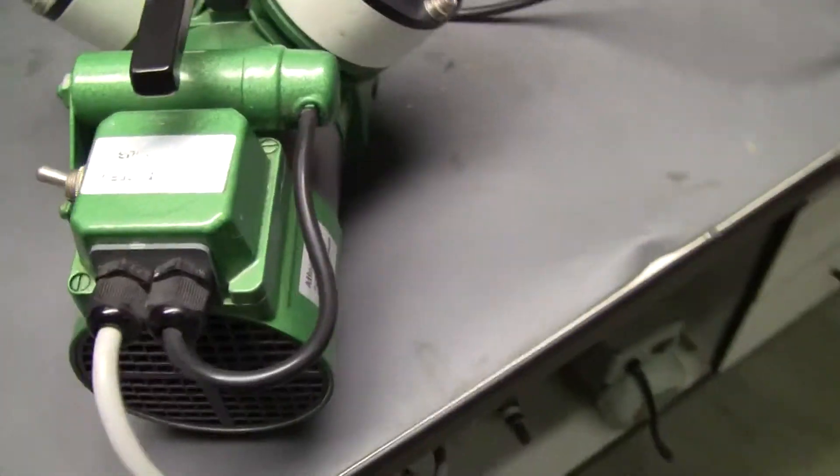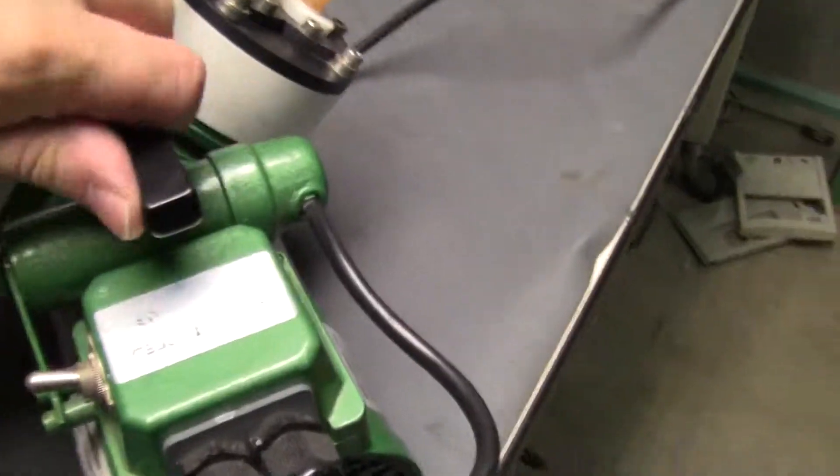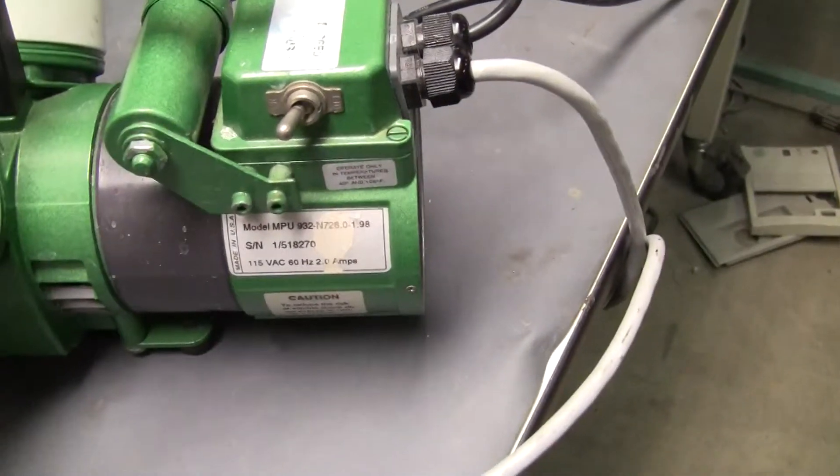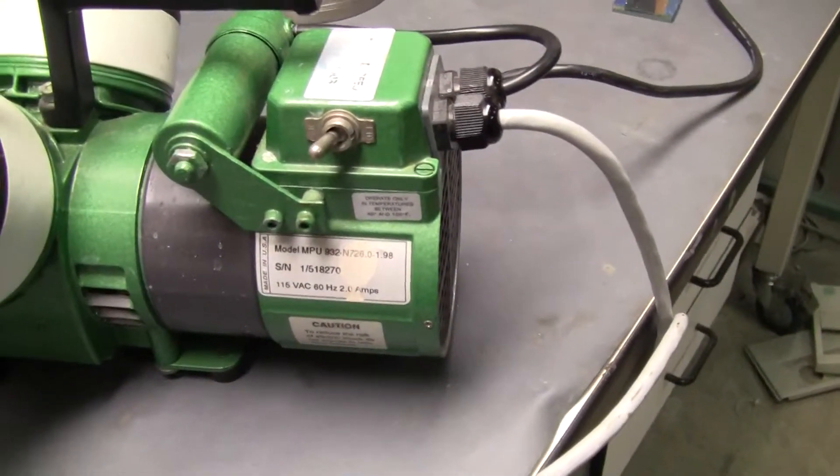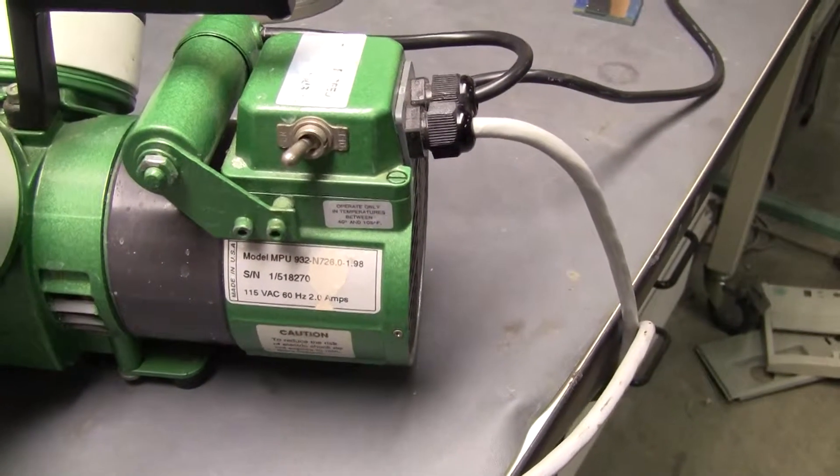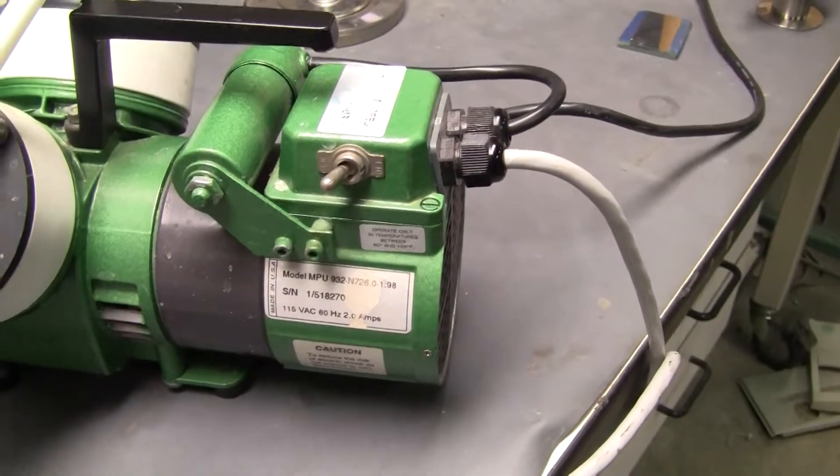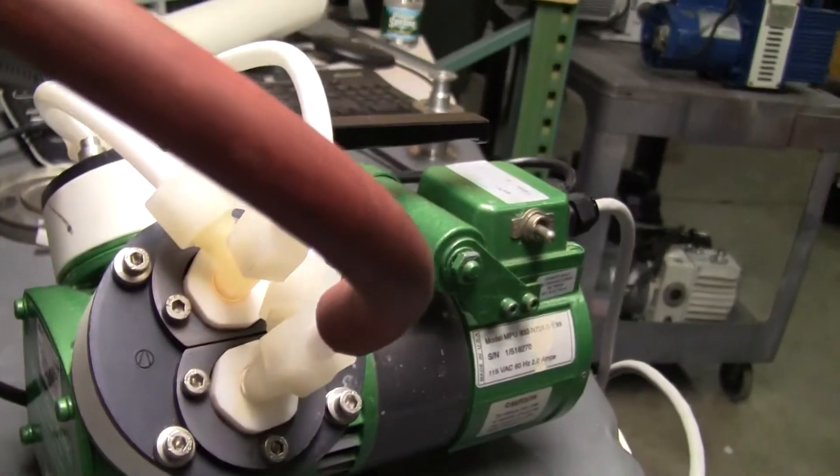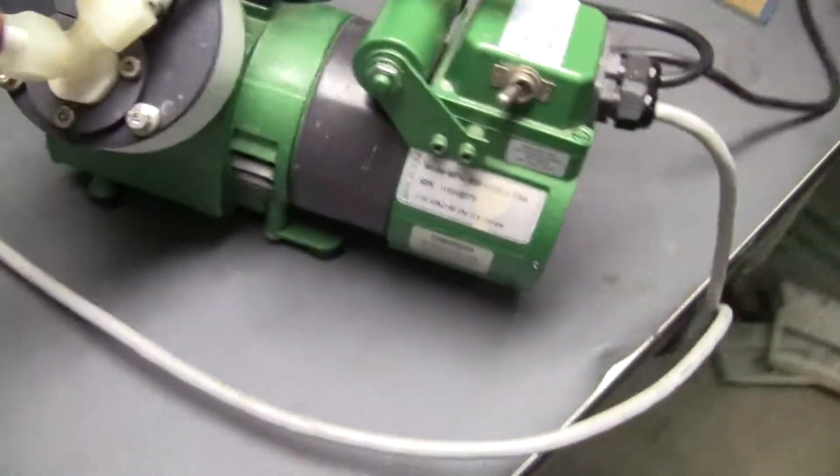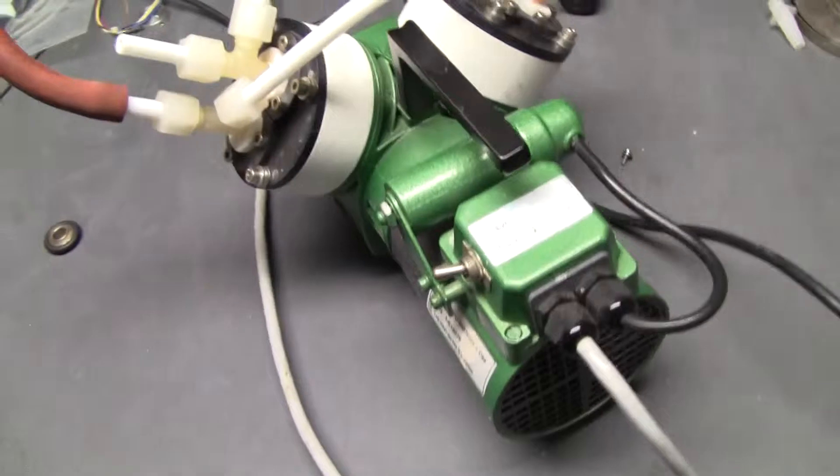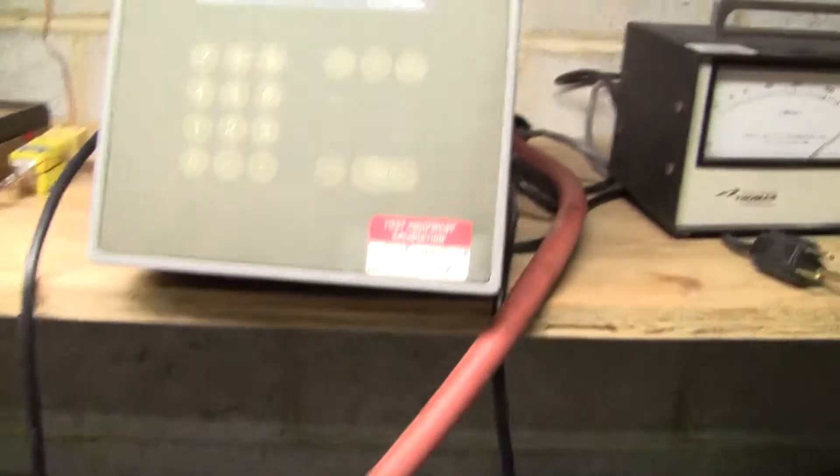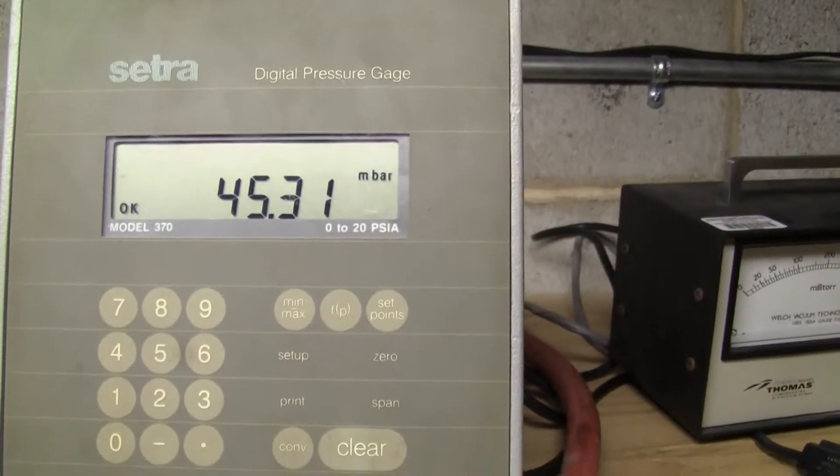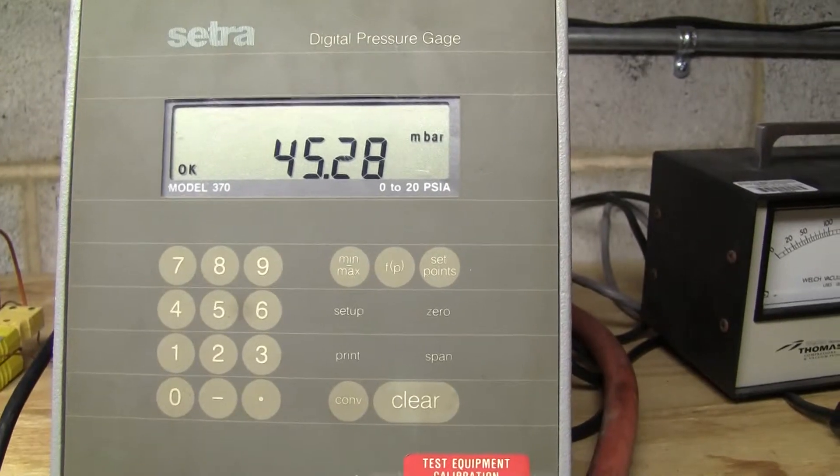Coming right along. The particular model is an MPU-932-N26-198. This is a dual diaphragm Teflon vacuum pump. Very nice, used for rotavap. This particular pump right now is pulling down just around 45 millibar, which is within specification.